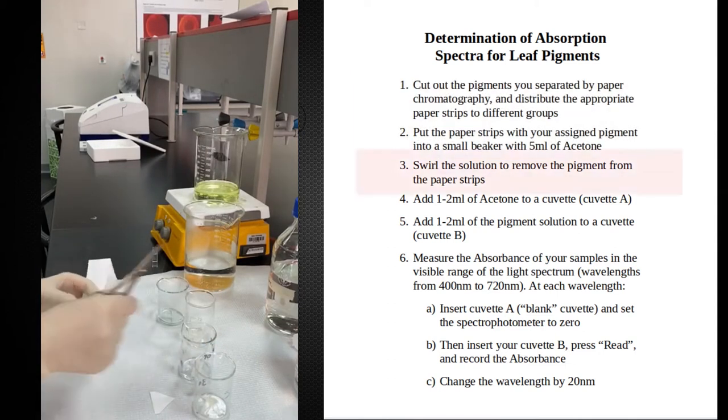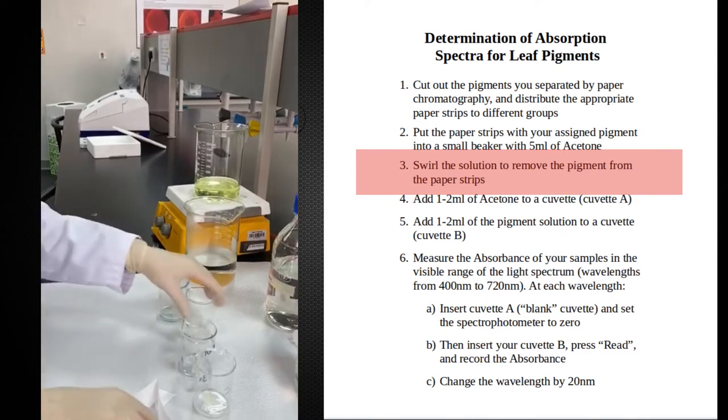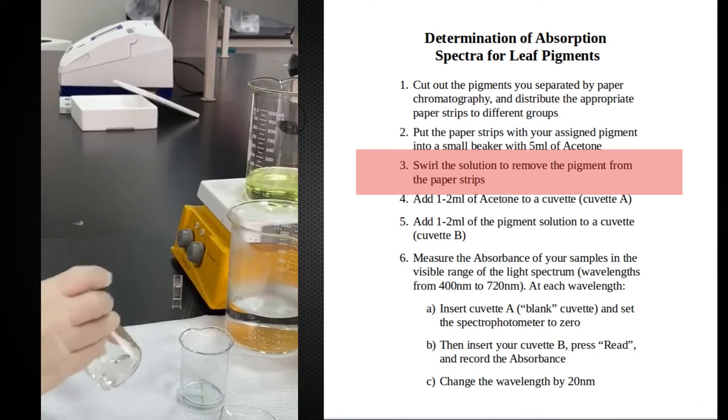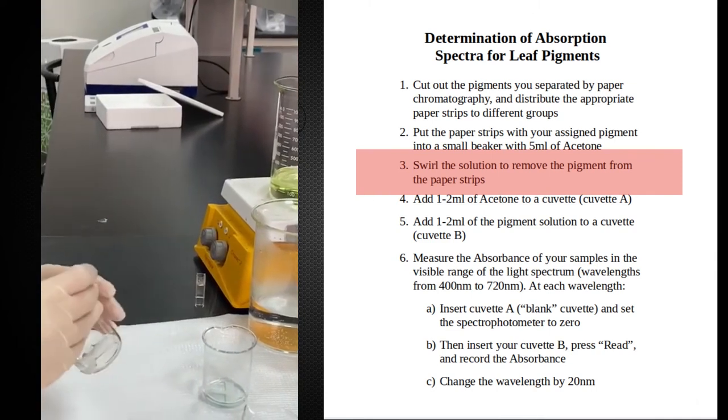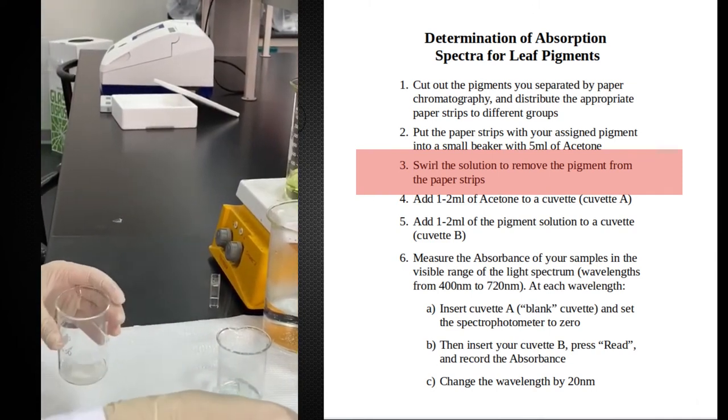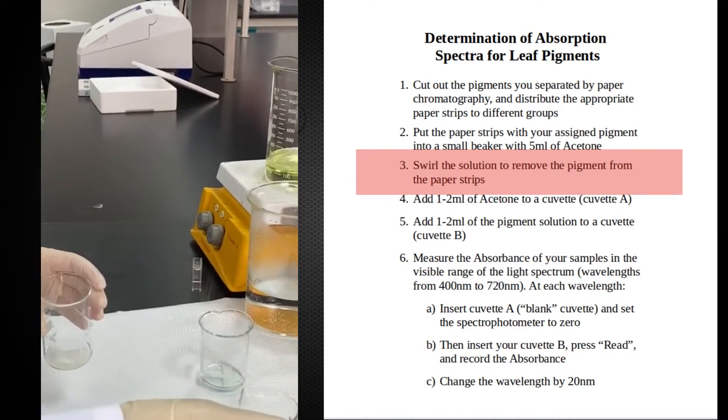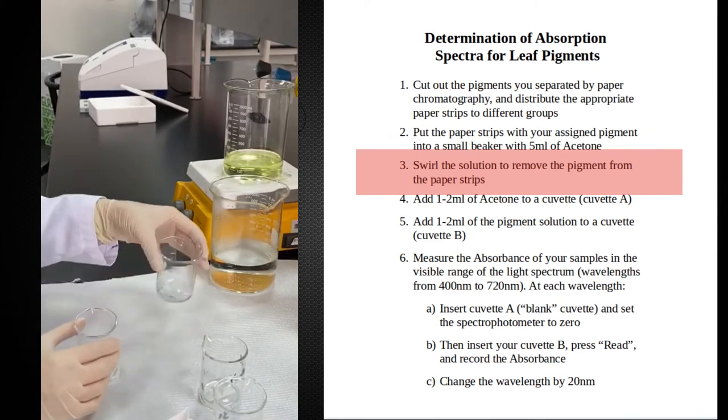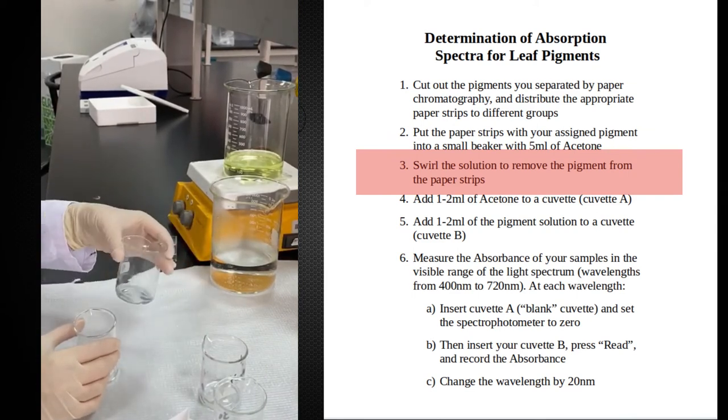I'll show you the example of one of them. So the way we do it is we mix those papers nicely with the acetone until I see that all my papers become totally white. This is the carotene, this is the xanthrophil, this is the chlorophyll A and this is the chlorophyll B.